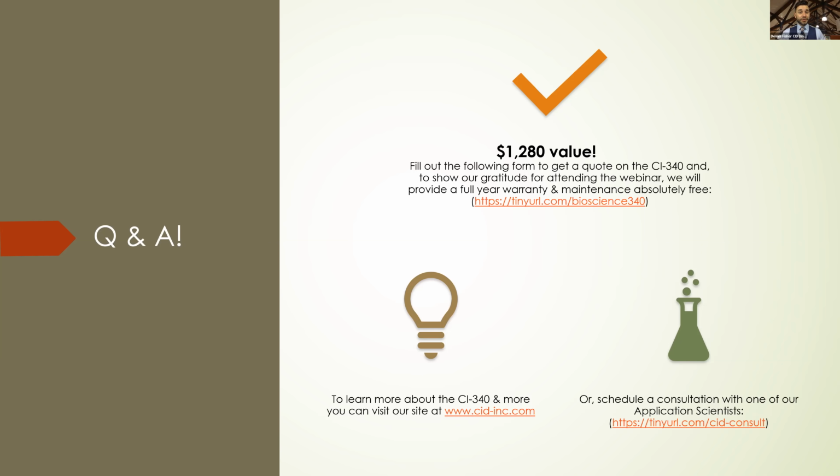And is it possible to update the instrument software? Would that require it to be sent to CID Inc? The instrument as it is right now, yes, you can update the software via any updates we push to our website, which we have on cid-inc.com, in a software section. And for any of those potential updates, we'll send out a notice to whoever has purchased one to say that this update is coming around, and give you the option of whether you want to apply it or not.